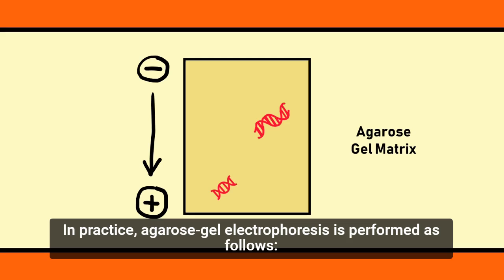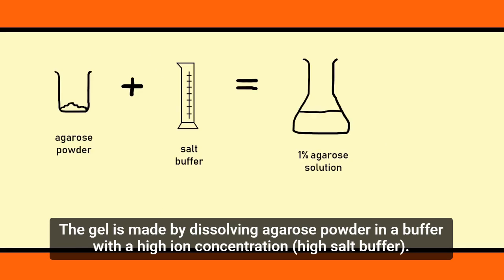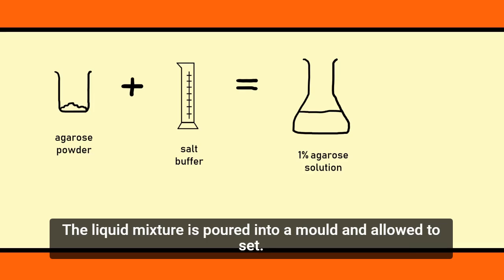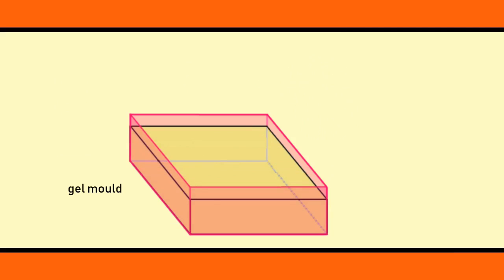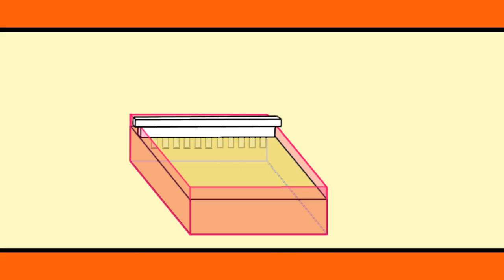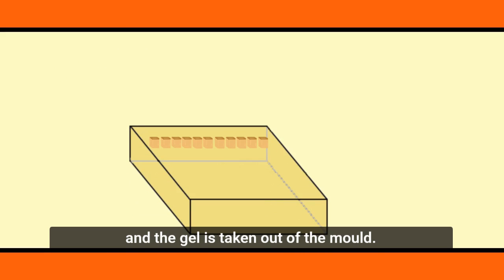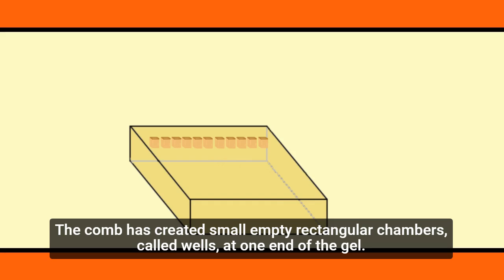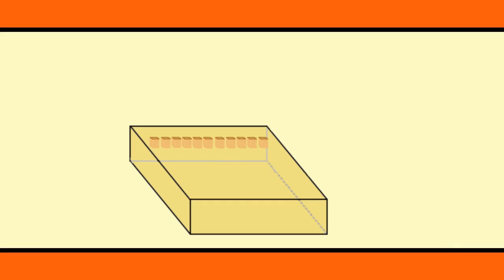In practice, agarose gel electrophoresis is performed as follows. The gel is made by dissolving agarose powder in a buffer with a high ion concentration, high salt buffer. The liquid mixture is poured into a mold and allowed to set. A comb is added, as shown here. When the gel is set, the comb is removed and the gel is taken out of the mold. The comb has created small empty rectangular chambers called wells at one end of the gel. The wells will keep the DNA samples apart so that they don't mix with each other.